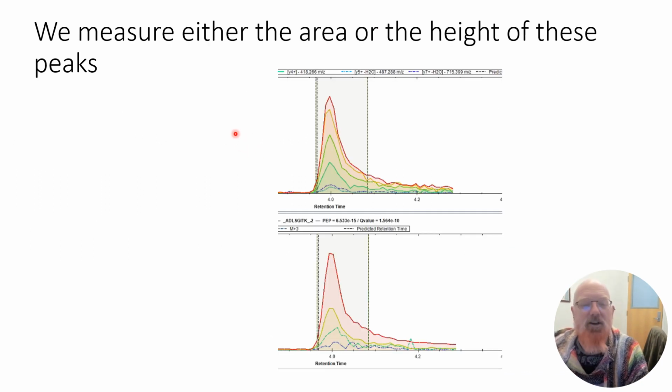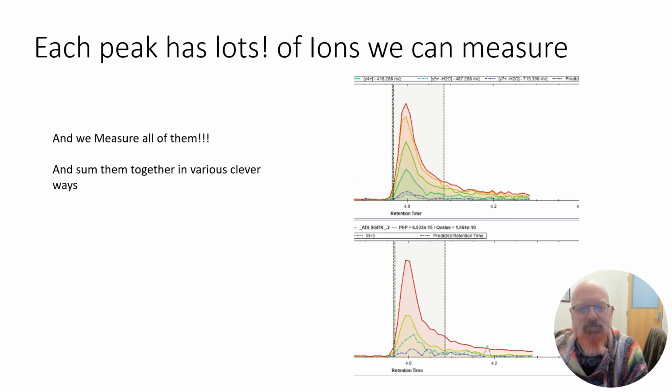All right, so as the peptides come off of these columns, they start eluting, and they form what we call peaks. And you can see sometimes they tail. They're not supposed to do this. They're supposed to look kind of Gaussian, but because everything's not perfect, they tail over time. So when you think of peaks in an LC-MS system, this is actually what we're talking about.